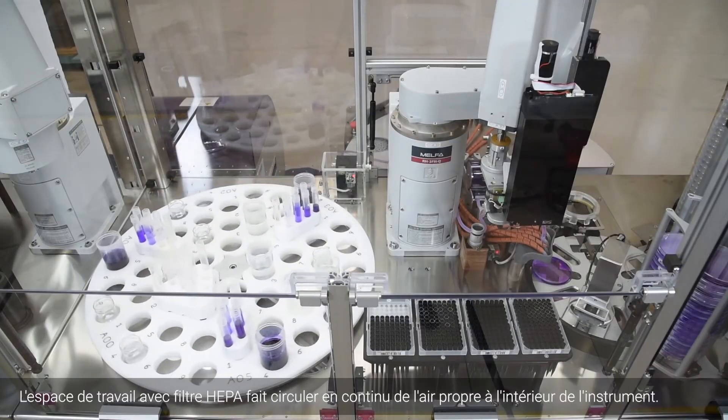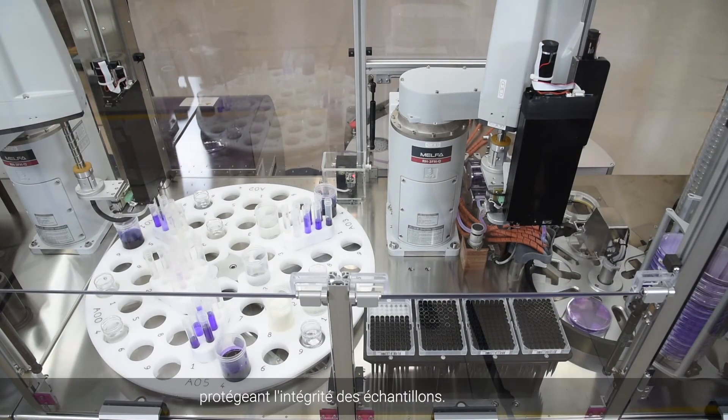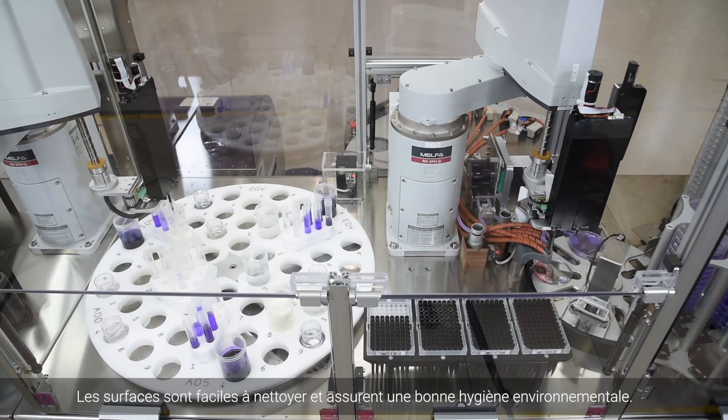Cyclone's HEPA-filtered workspace continuously circulates clean air within the instrument, protecting sample integrity. Built-in UV lights and easy-to-clean surfaces ensure proper environmental hygiene.